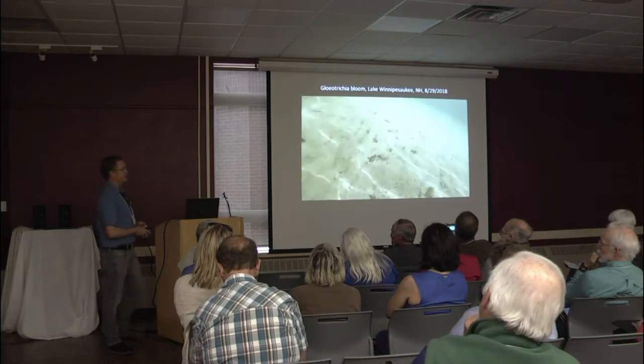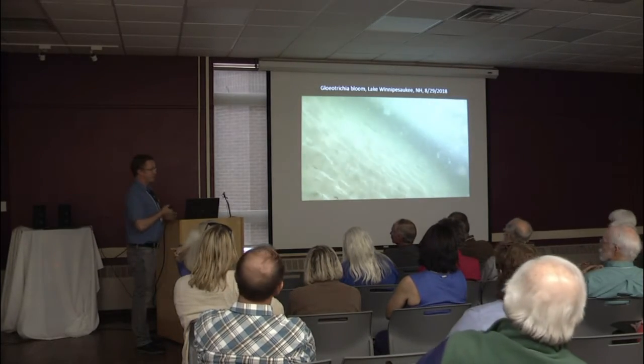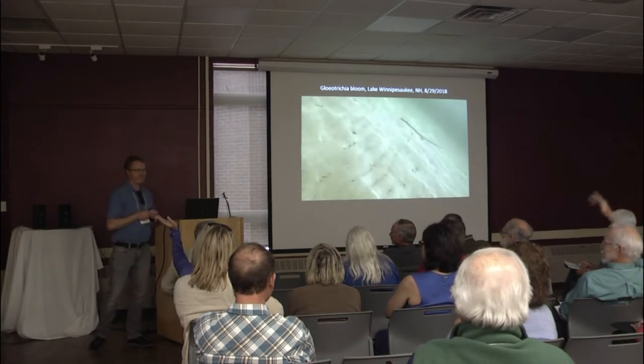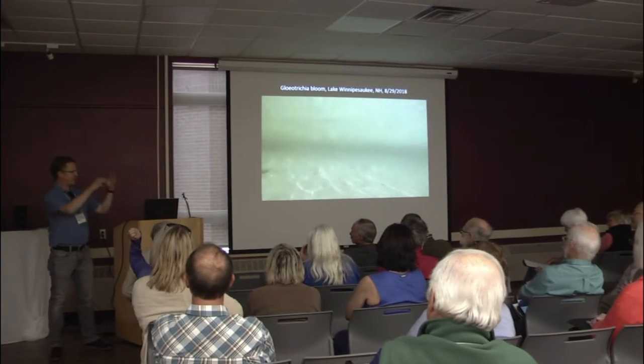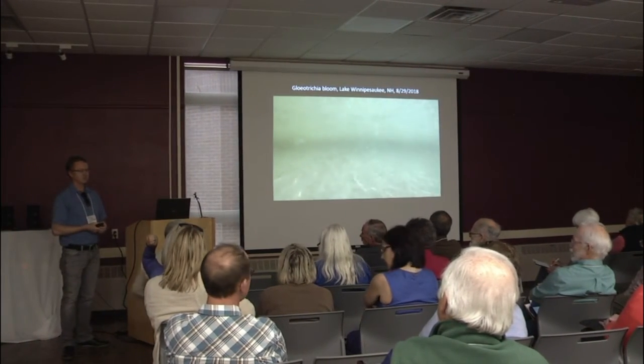It did react. And so what was all the stuff on the bottom? I don't know. I got distracted by the cyanobacteria. Metaphyton. Yeah, but it wasn't green. No, it's that cloudy metaphyton, flocculent material. It usually looks green, not white.